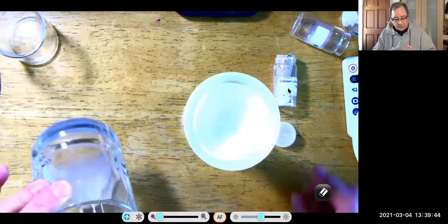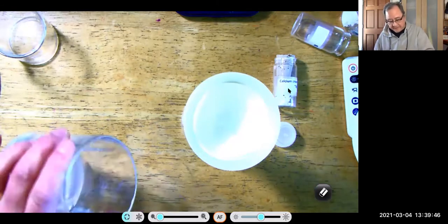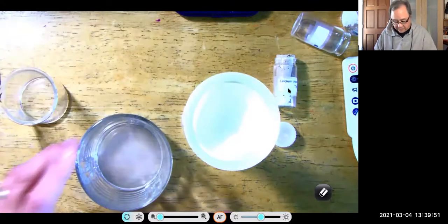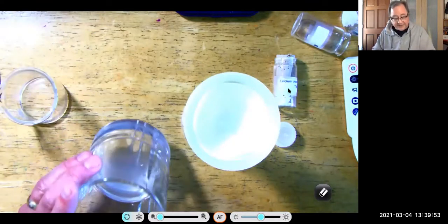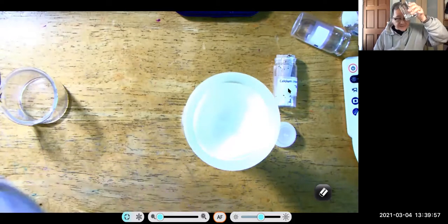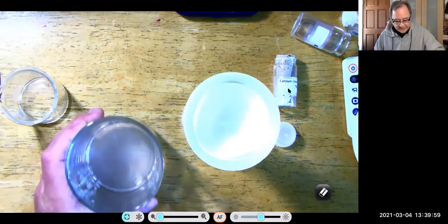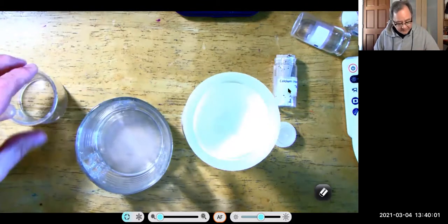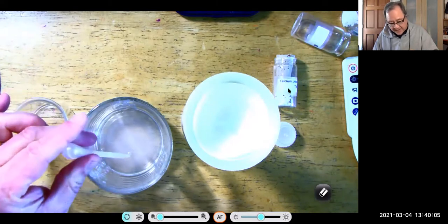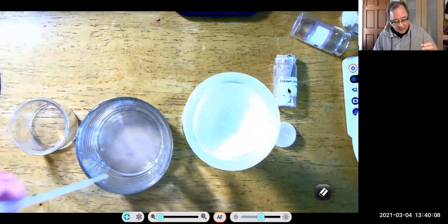So my calcium chloride is still a little foggy, but I believe it's good enough to use. In the best of worlds, I would let this settle and decant, because then I would have a saturated solution. But nonetheless, I think it's okay to use. I'm going to take my pipette here and add the calcium chloride to my carbonate.